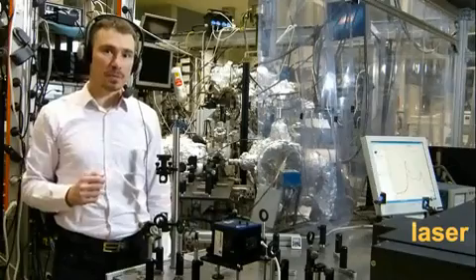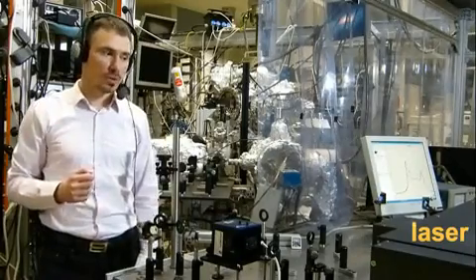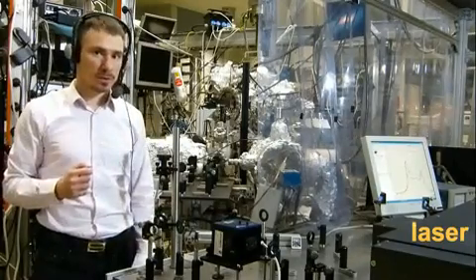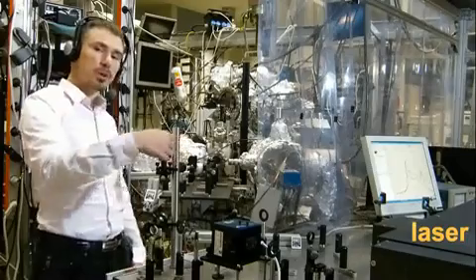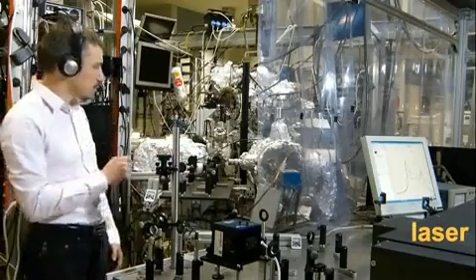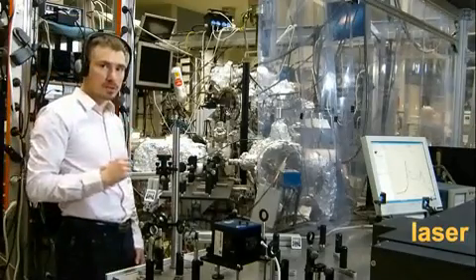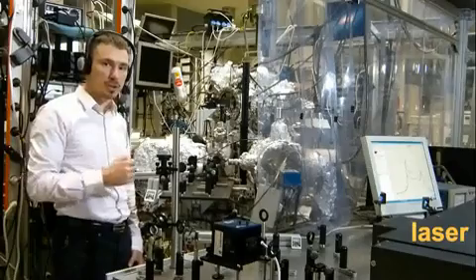It's an infrared laser with a pulse energy of 14 microjoules and a repetition rate of about 1 MHz. With just a few optical components, we guide the laser beam into the ultra-high vacuum chamber where the high order harmonic generation takes place.